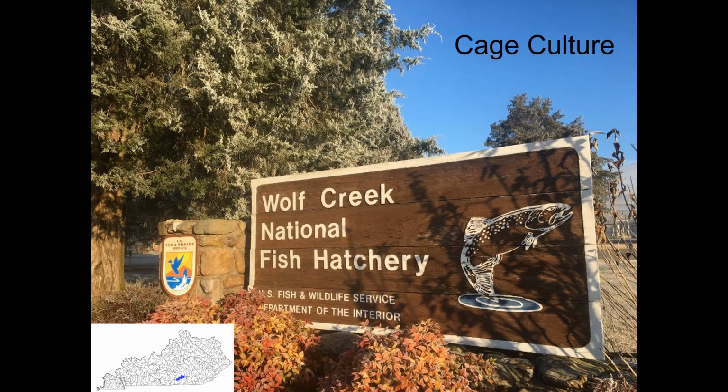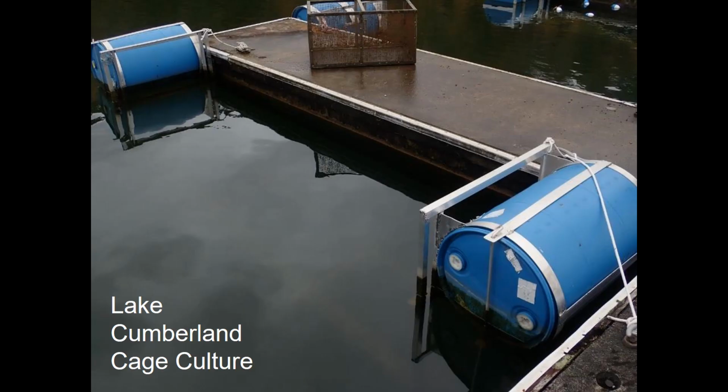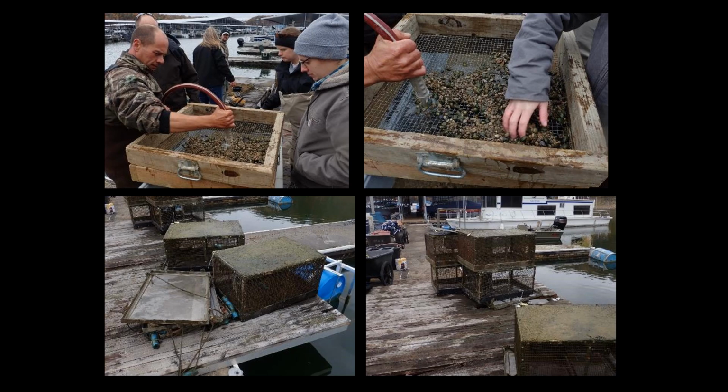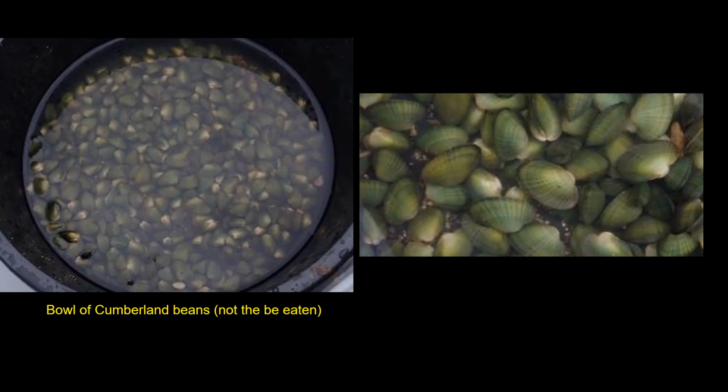The cage culture has been very promising. We're able to take the juveniles and put them in these floating cages. Each cage system includes a floating rack with 5 cages, and we put these in for a few months, and then at the end of the period, usually around the 1st of November, we're able to rinse the juveniles from the sand into these screens and collect them. We had very good survival.